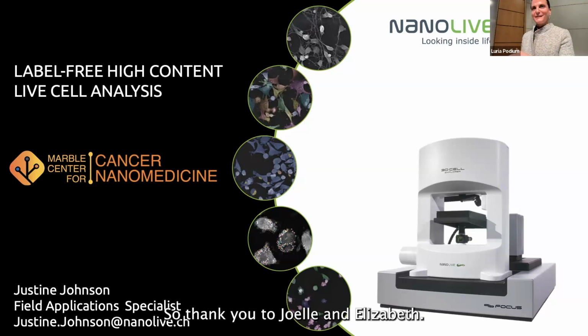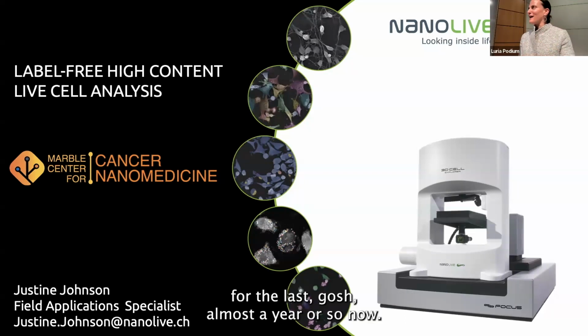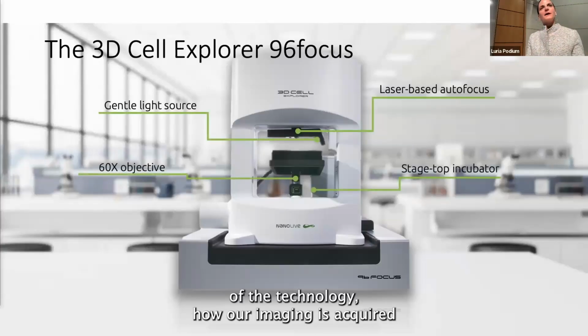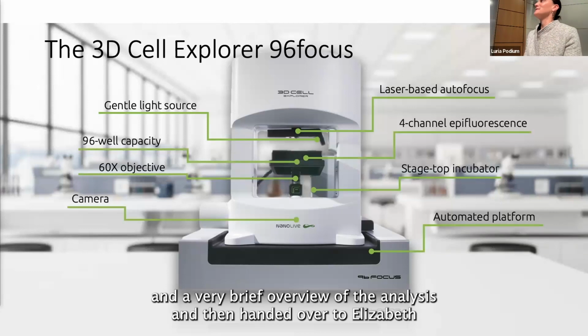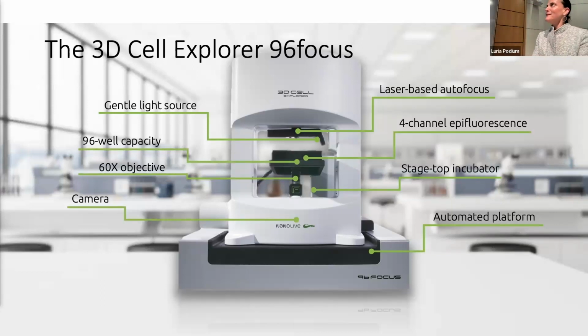So thank you to Joelle and Elizabeth. This has been a really fun project to work through for the last, almost a year or so now. So I'm going to give a quick overview of the technology, how our imaging is acquired, and a very brief overview of the analysis, and then hand it over to Elizabeth to do the really cool stuff, which is the real data.